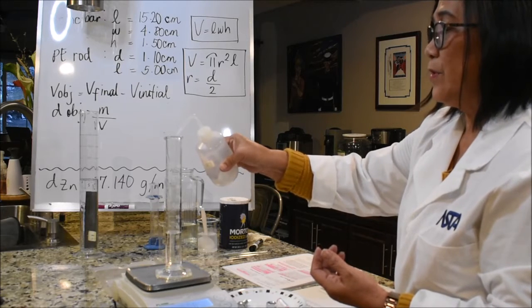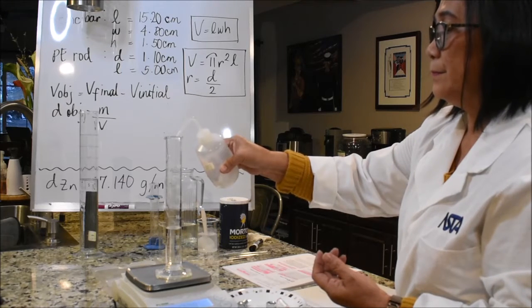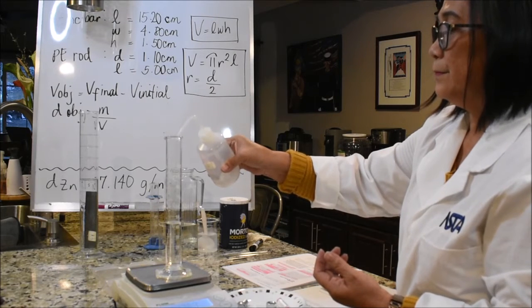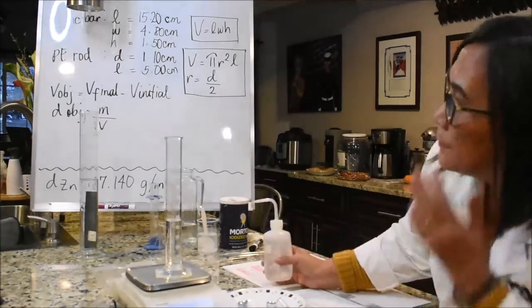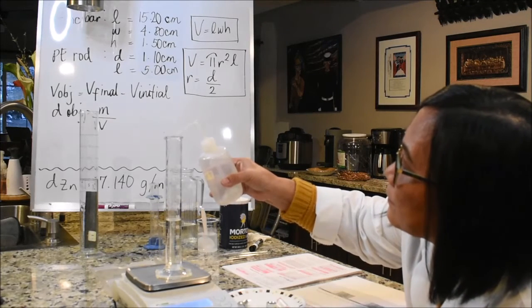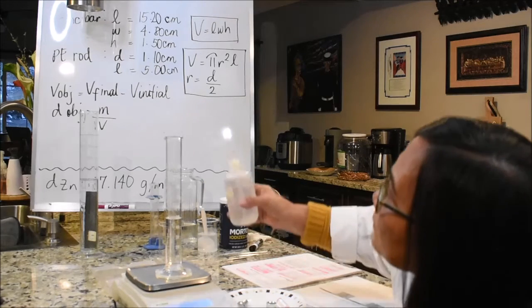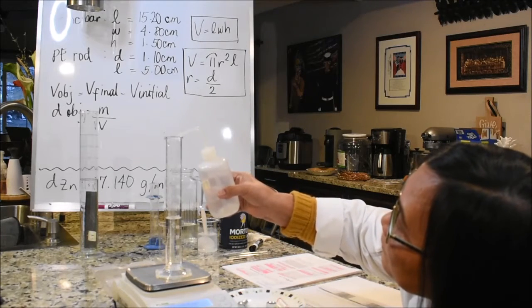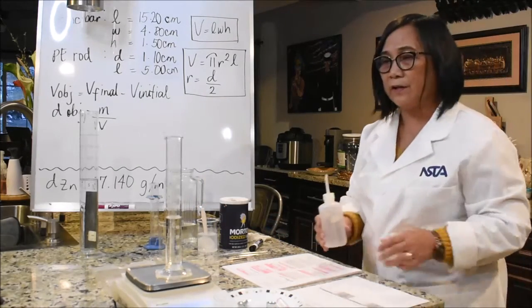Just a little bit more squirts. Okay, guys, always read at the lower meniscus of a colorless liquid.